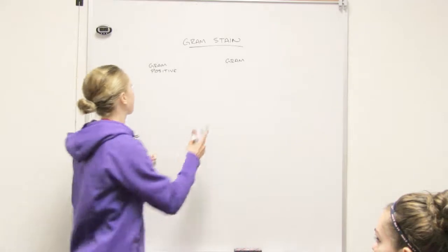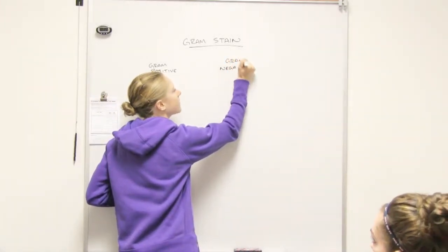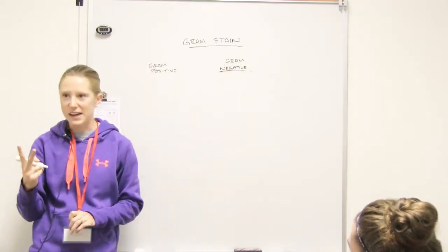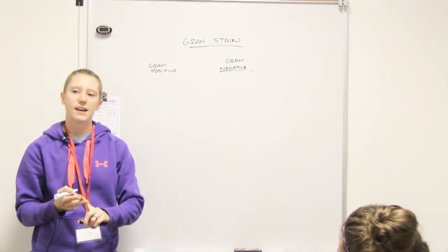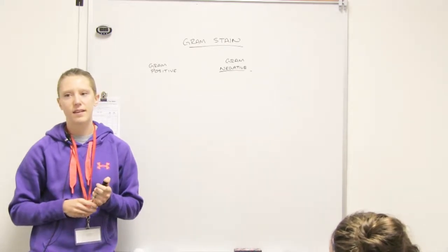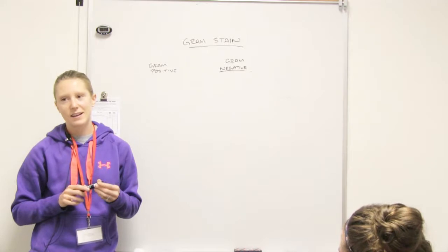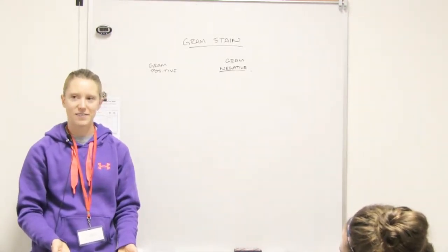Why would I not stain a virus? It's too small. The light just passes through and doesn't bounce off. There are two kinds of microscopes, right? The light microscope and the electron. Which one do I look at a virus under? Electron. Can you see color in an electron microscope? No. So even if you did somehow stain it, you couldn't see what you're looking at, right?